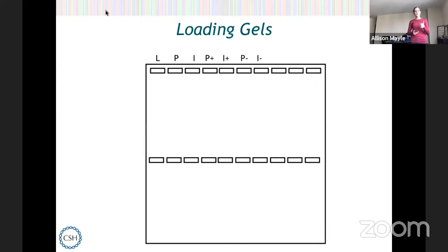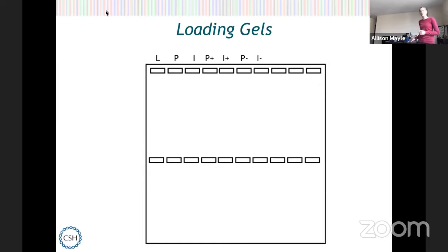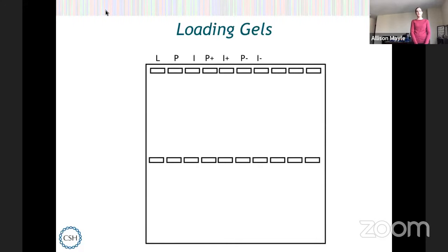You might want to draw a little map of where you loaded your samples on your agarose gel. The L all the way on the left stands for ladder. A DNA ladder or molecular weight marker is something we often include on the gel — it's a set of standards you compare your DNA to. These are commercially available pieces of DNA, all mixed together, and we know how big each of those pieces is. We know the one that runs furthest down the gel is 100 base pairs long, and it goes up to a little bit above a thousand in the case we're using today.